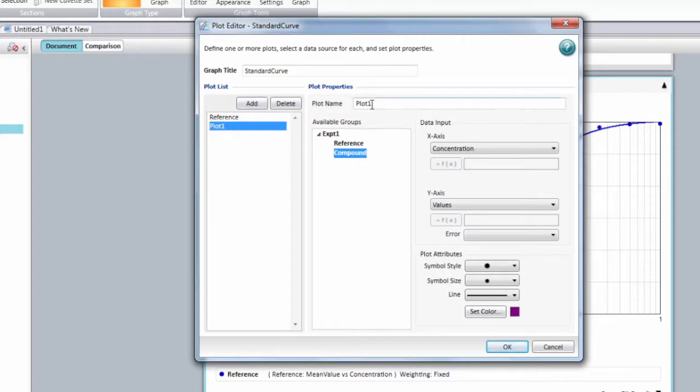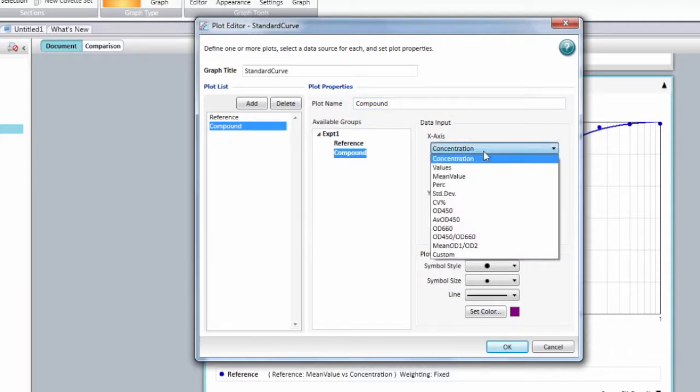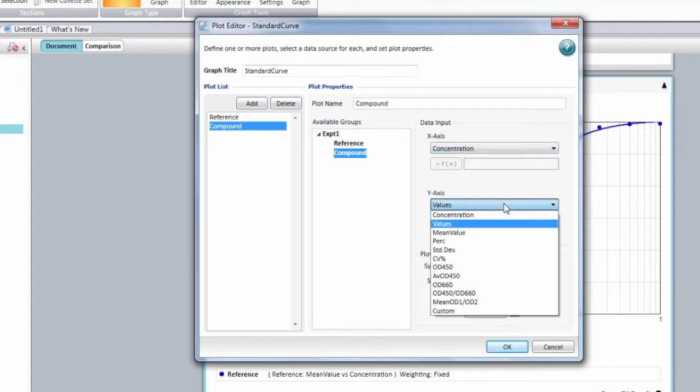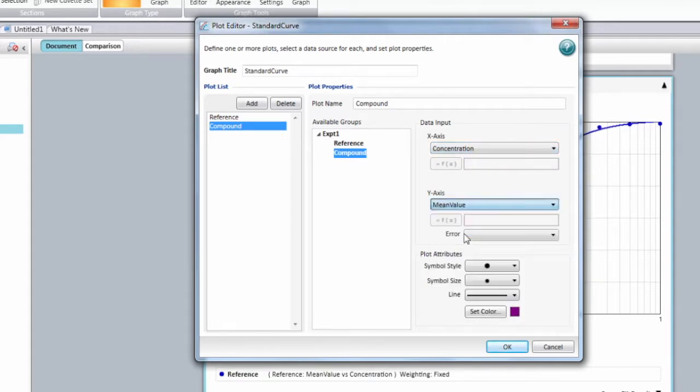You can rename that plot and you're going to be able to choose from one of the columns of that group for the x-axis, one of the columns from that group for the y-axis.